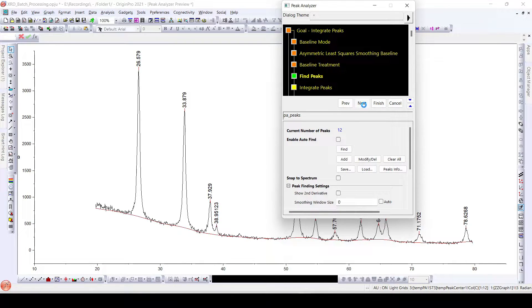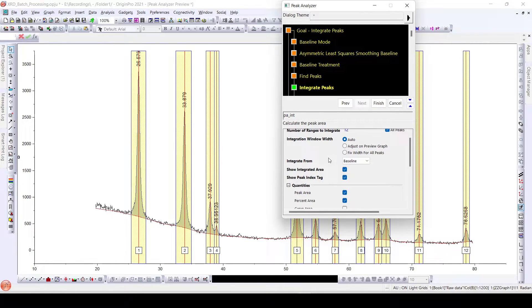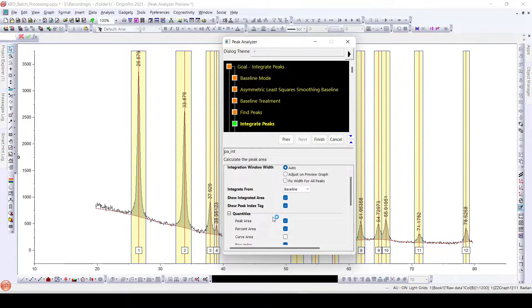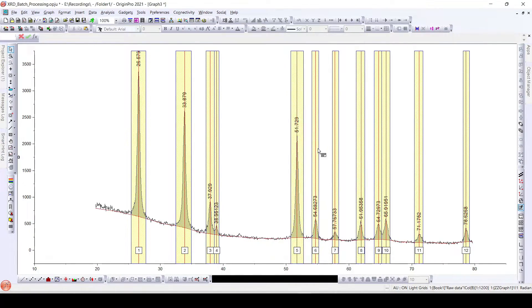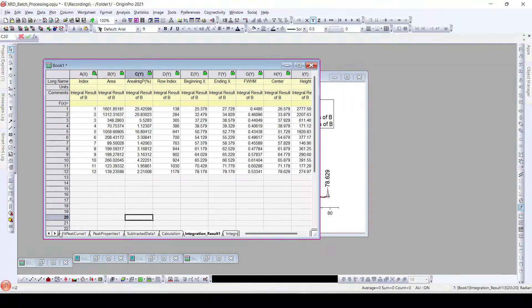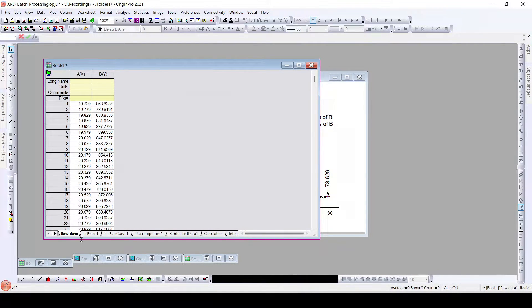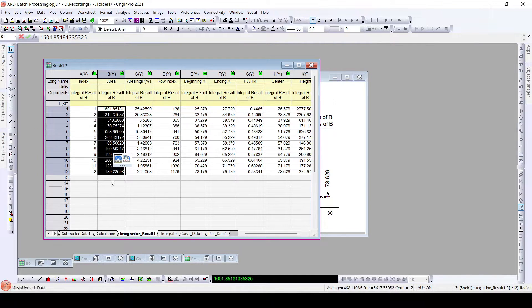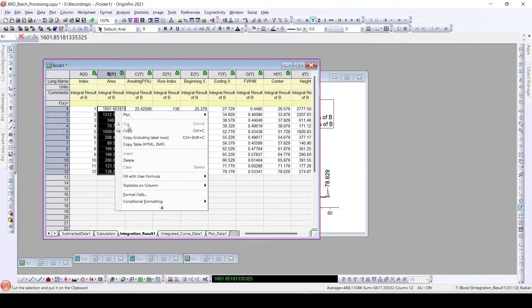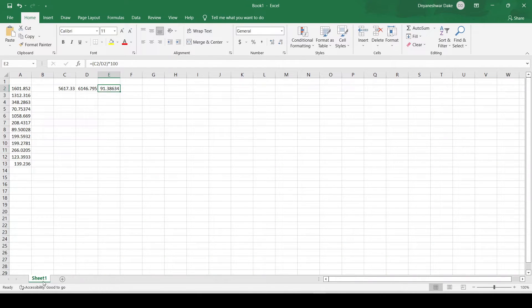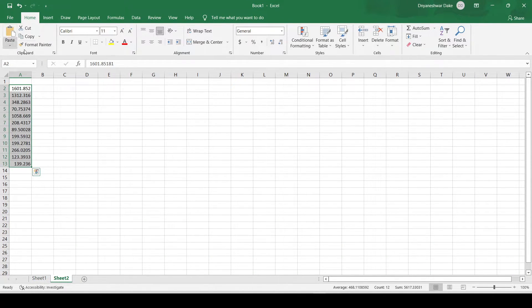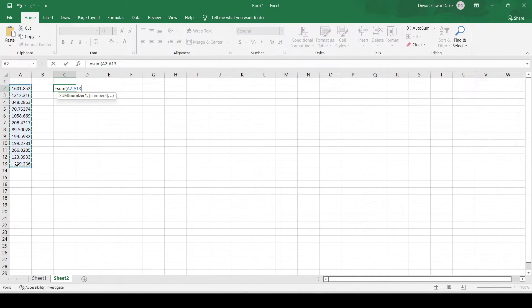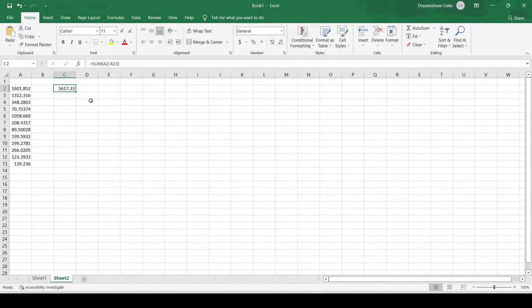Now we click Next. Here we can see 'Show Peak Integrated Area' — all the peaks are selected and the area under each peak can be calculated. We click Finish. In the resulting worksheet, we get the integration results showing the area of each individual peak. We copy this to an Excel file, paste it, and sum it up to get the total area under all the peaks.